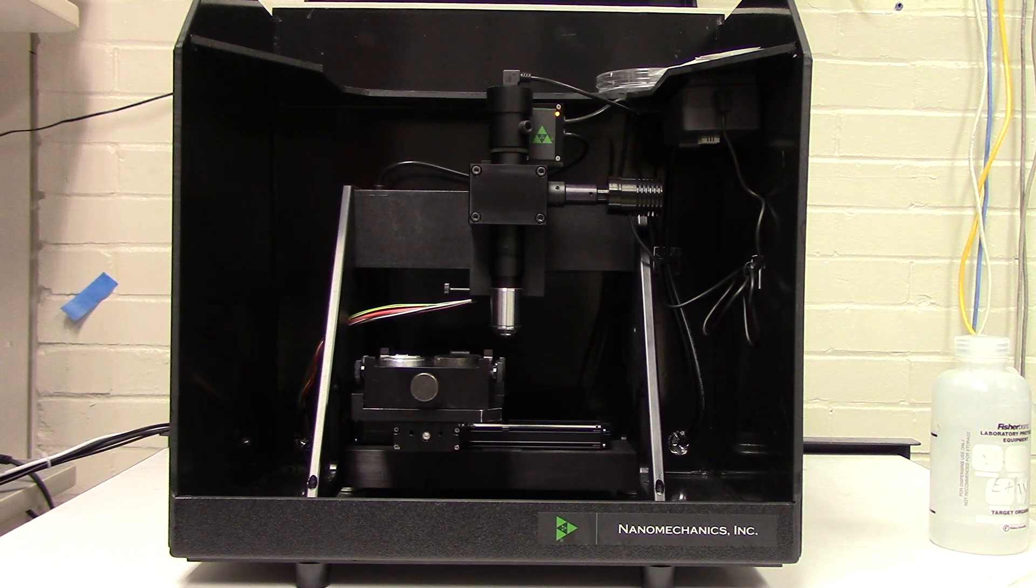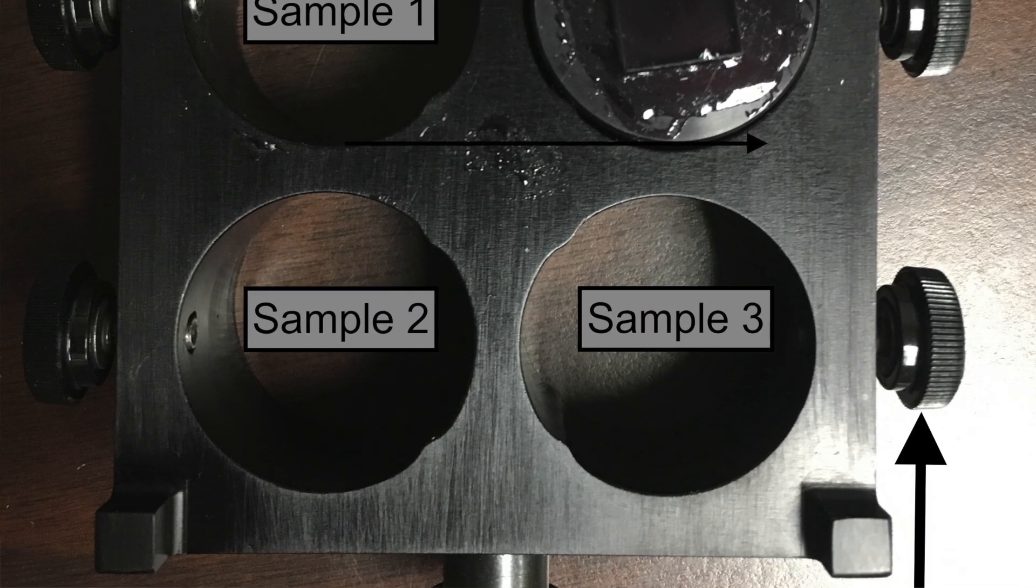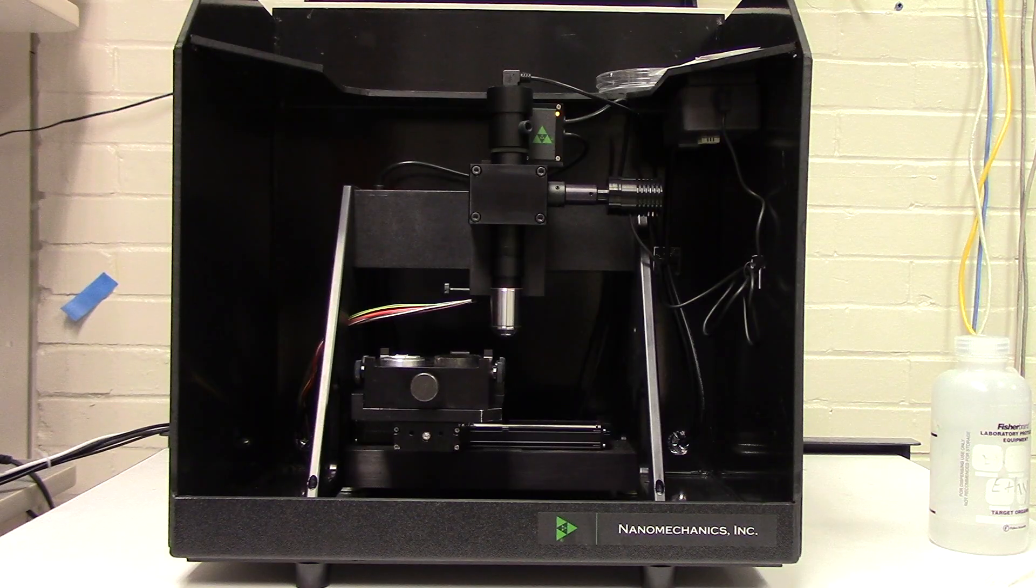The sample tray is magnetic, allowing for easy retrieval and placement. You can place up to four different mounts into here, with fused silica always occupying one of the slots for data verification and tip calibration.